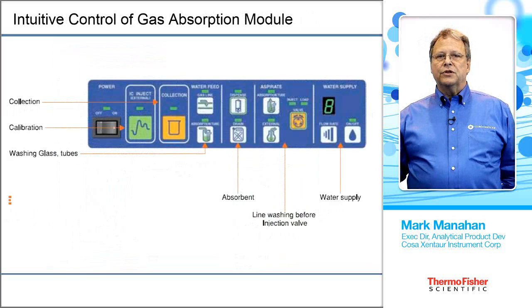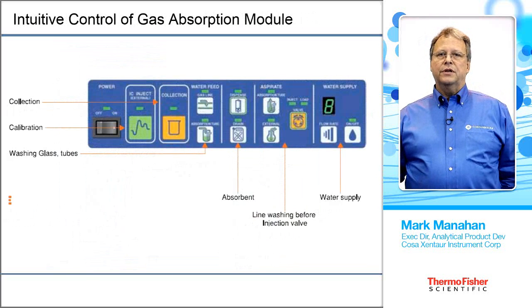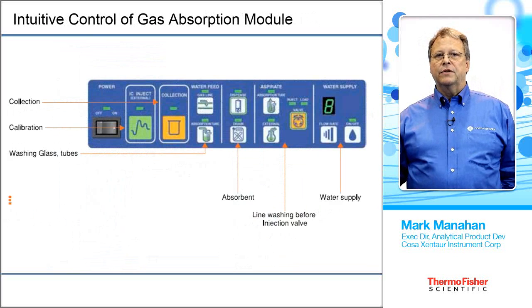Here is the actual control panel, so you don't have to control the unit through the software. You can actually control it manually through the control panel, similar to the control screen on the ICS-2100. This allows for routine troubleshooting very easily without having to run the full system.